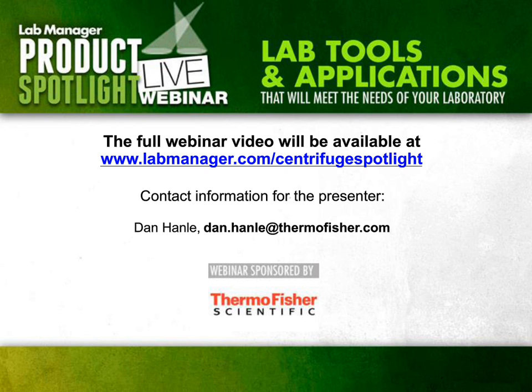Great, thank you. Now, you mentioned that benchtop models are becoming more robust, I guess, for lack of a better term. If you're trying to choose between a benchtop and floor model centrifuge, what sort of options are there out there?